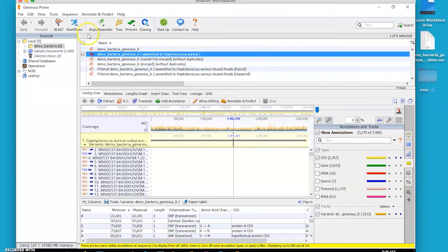By the way, this is the document panel in Geneious up here. That will bring up three other panels, or at least it should. This may depend on where you're at with Geneious. If you've already run Geneious a few times, it may look a little bit different than this, depending on how you save and configure things. But you should be able to bring up the sequence view panel in the middle, and on the right, there will be the configuration panel. And down on the bottom, there will be a spreadsheet panel.